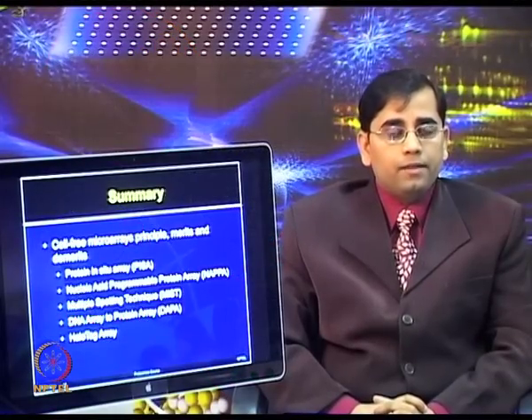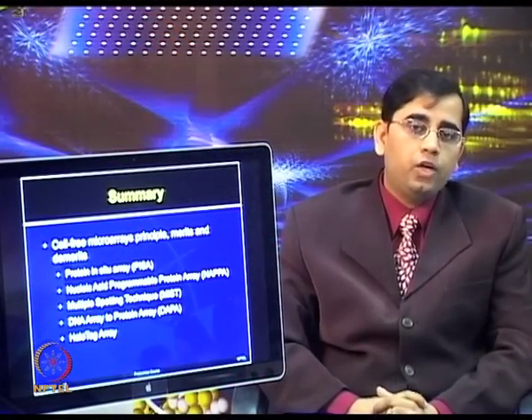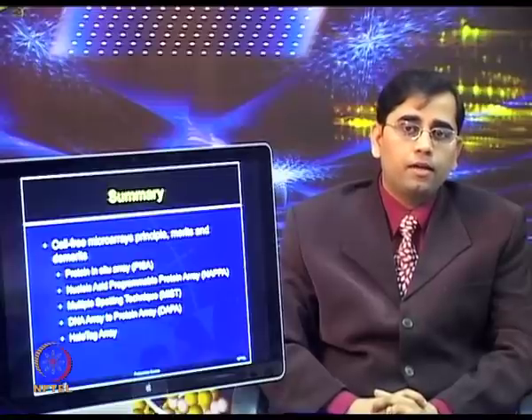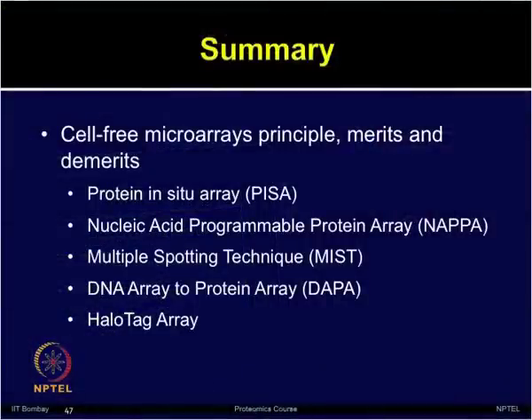So, protein microarrays offer a range of diverse applications and are being adopted extensively for clinical as well as non-clinical studies. The cell-free expression systems facilitate synthesis of several proteins in a single reaction and produce proteins on demand and eliminate concern of storage and protein stability.